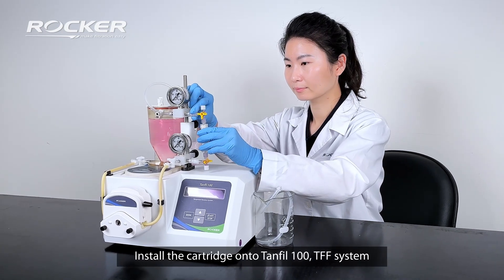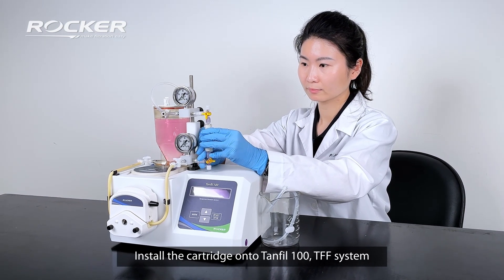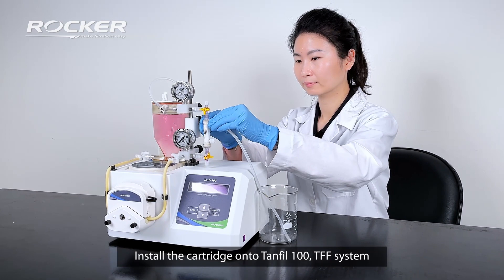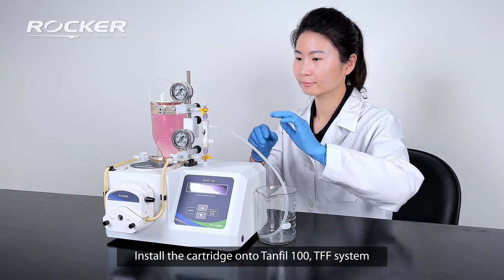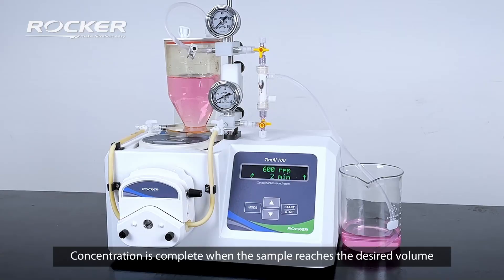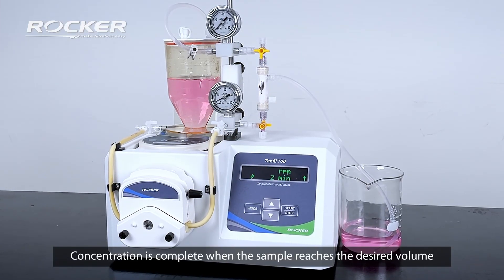Install the cartridge onto the Tanfil 100 TFF system. Start concentration. Concentration is complete when the sample reaches the desired volume.